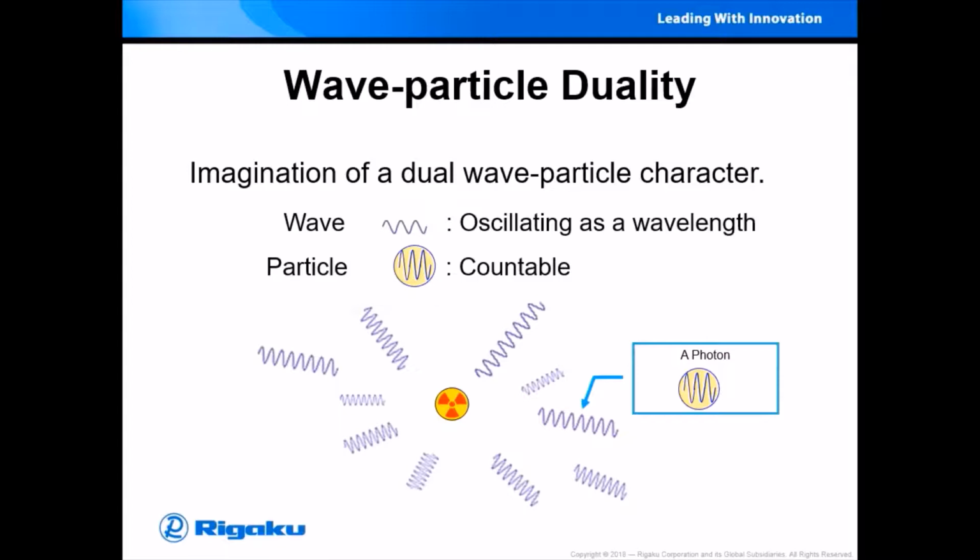Finally, let me show you an imagination of the dual wave-particle nature. X-ray photons can be counted and each photon oscillates with the wavelengths.